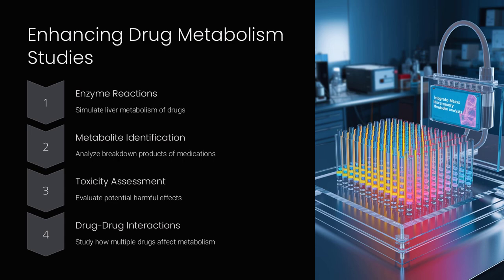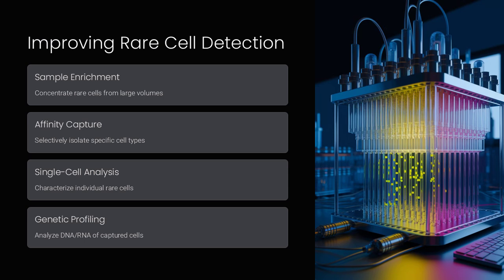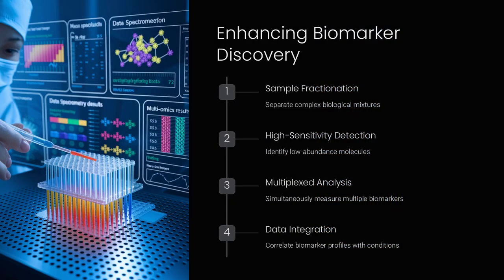In addition to streamlining traditional lab processes, digital microfluidics is pushing the boundaries of what is possible in lab automation. For example, these platforms can be integrated with optical, electrical, and even mass spectrometry sensors, allowing for real-time monitoring and data acquisition directly on the chip. This integration facilitates immediate feedback and rapid decision-making, crucial in clinical settings where time is of the essence. Could this technology eventually lead to fully autonomous laboratories where experiments are conducted, analyzed, and adjusted in real time without human oversight?